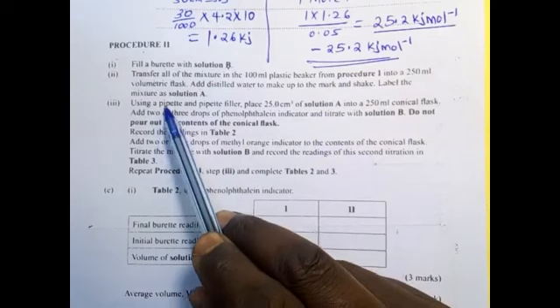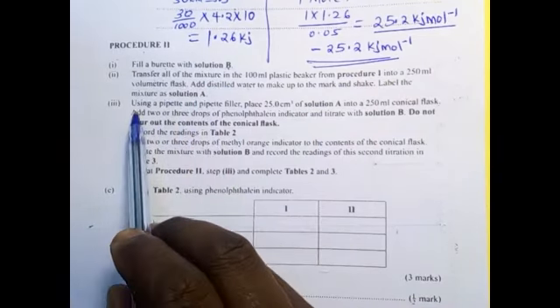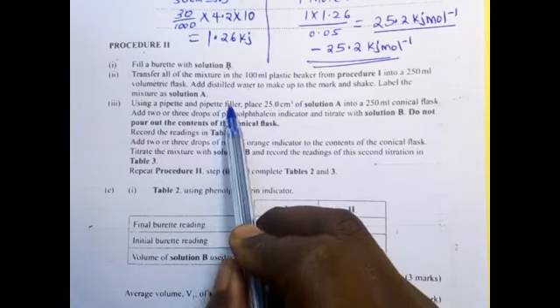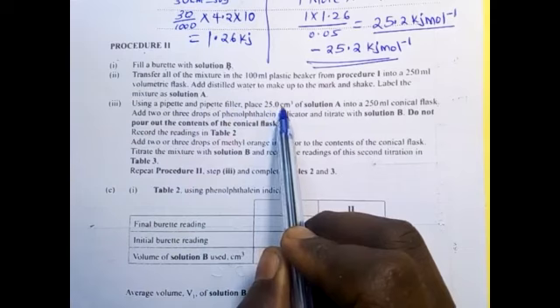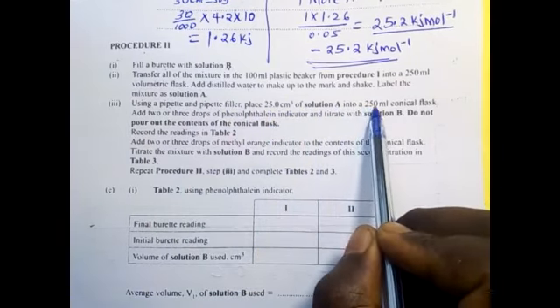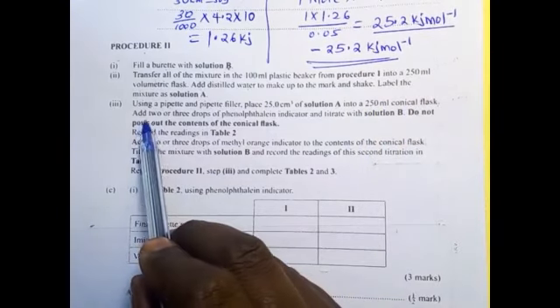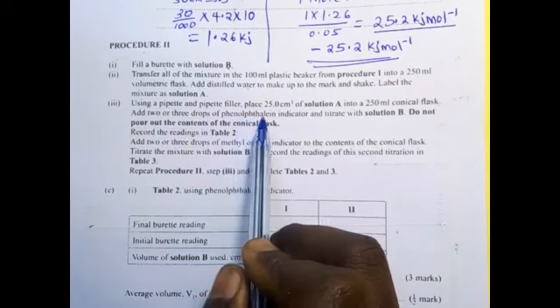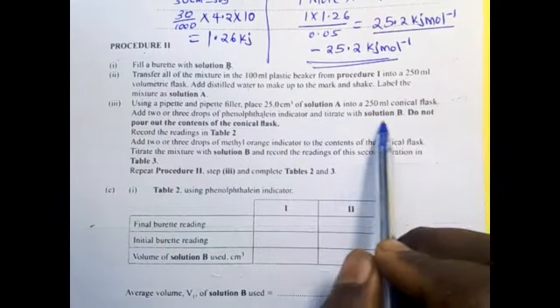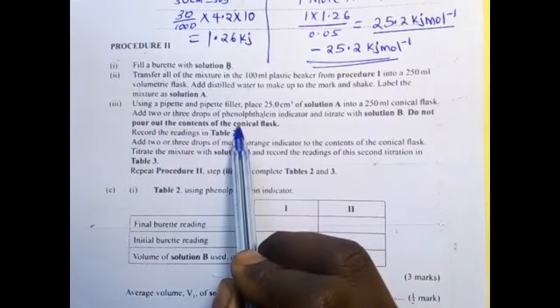Label the mixture solution A. Using a pipette and a pipette filler, place 25 cm³ of solution A into a 250 cm³ conical flask. Add 2 or 3 drops of phenolphthalein indicator and titrate with solution B. Do not pour out the content of the conical flask.